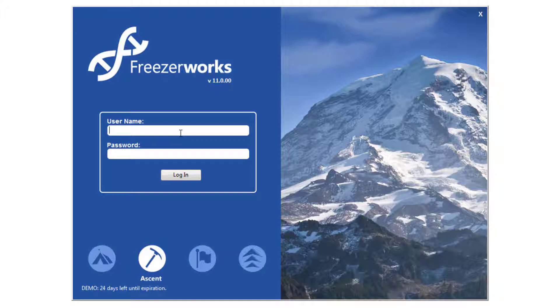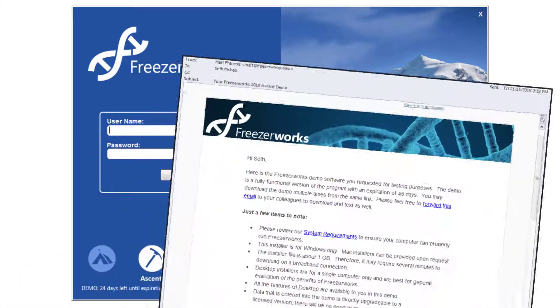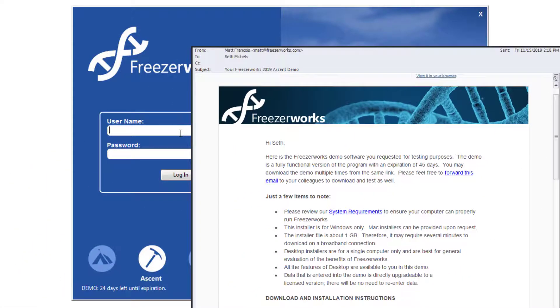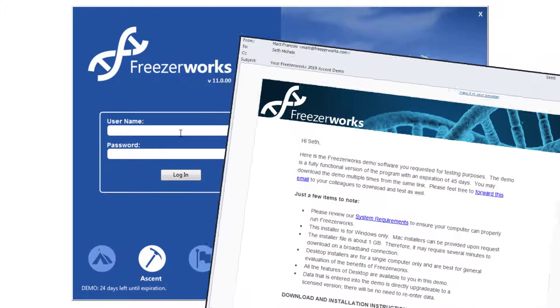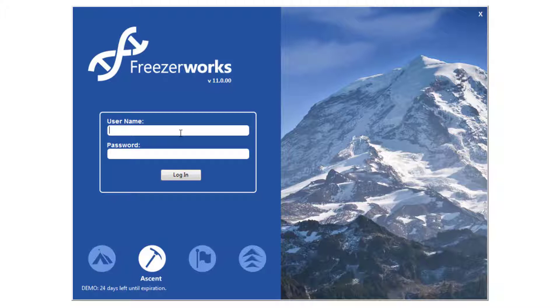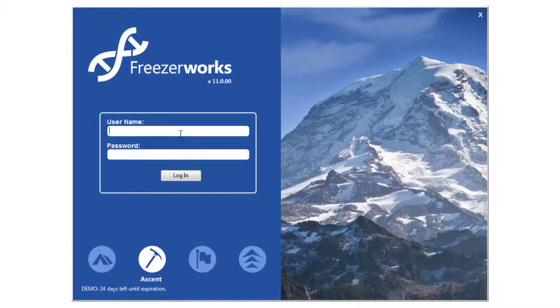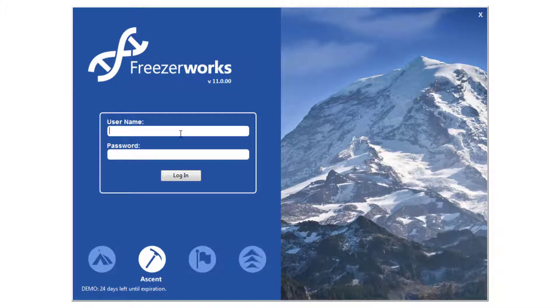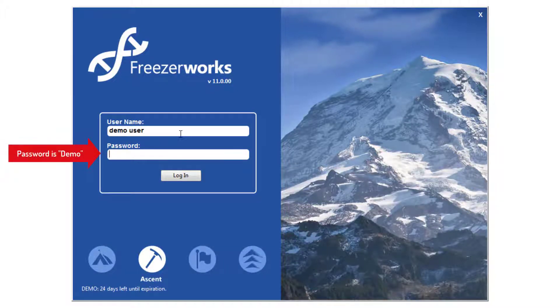Since you're watching this video, you probably received an email from your account manager with information about downloading the FreezaWorks demo. Follow that email now to install FreezaWorks. Once installed, open the program and get yourself logged in. Use the username DemoUser with the password Demo.